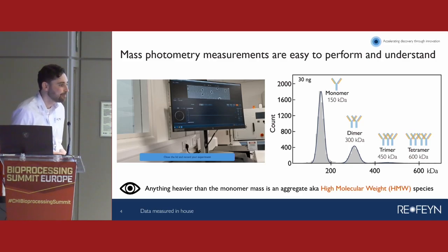Hi, Stephen. Hi. We have been having a lot of fun with the refinement to MP. I was quite surprised to see the difference that you could already capture for the antibody drug conjugate compared to the naked antibody. And that's because there's just one fixed DAR ratio in that sample, right? If there's a mix of different DAR ratios, would you still be able to capture it, or would it be just one huge peak?